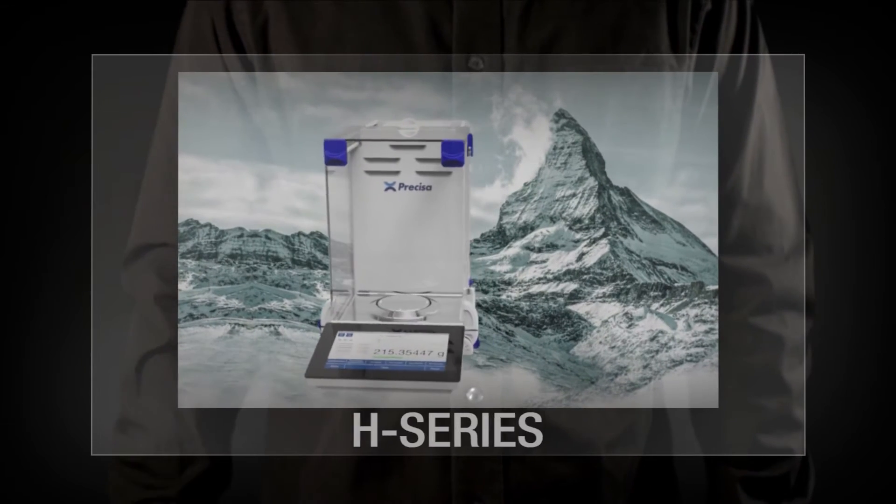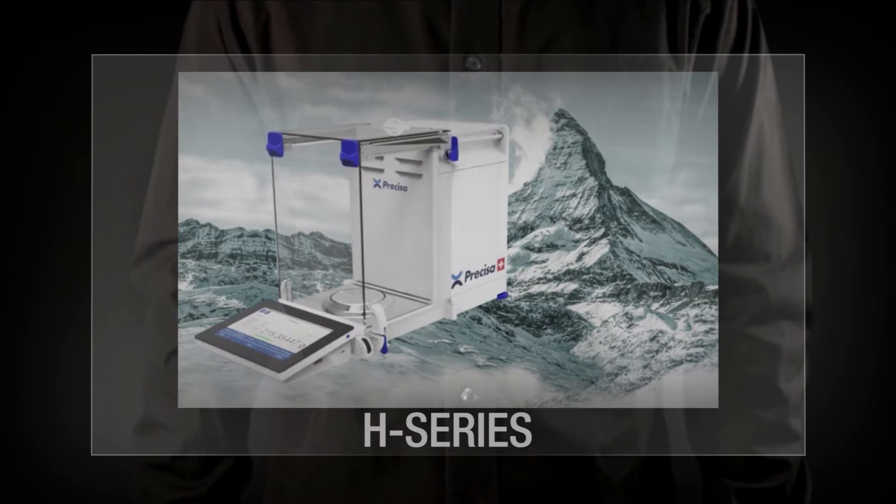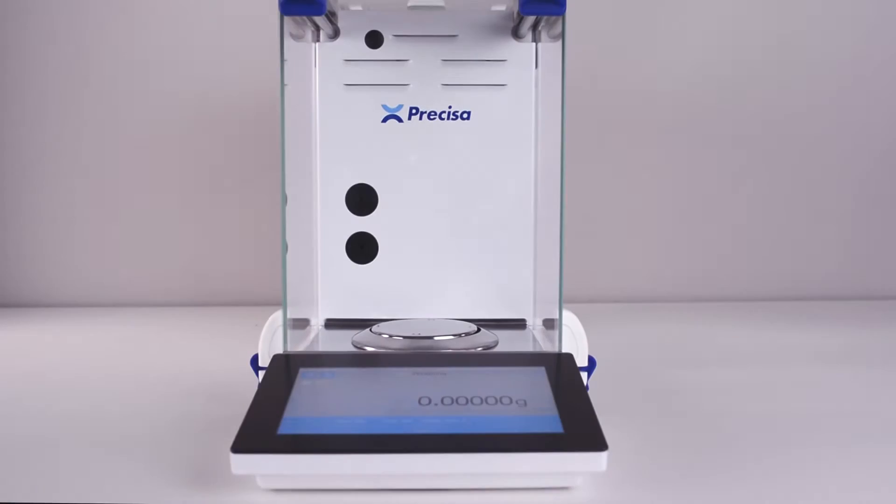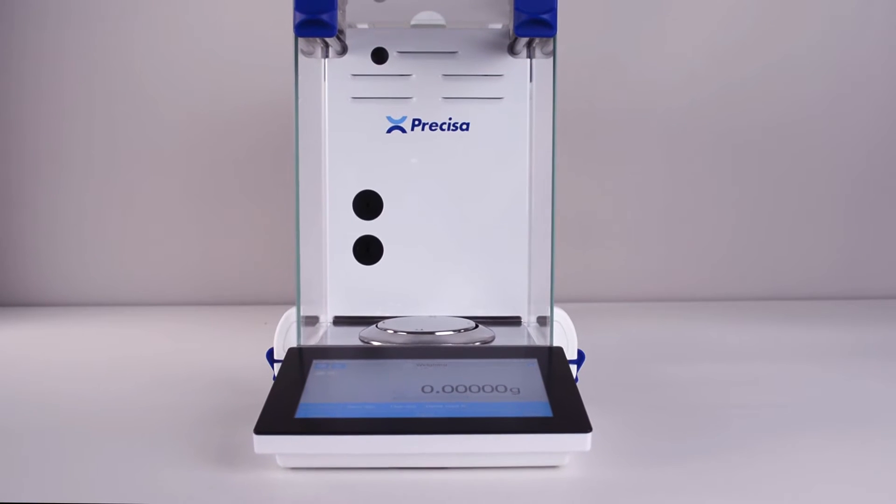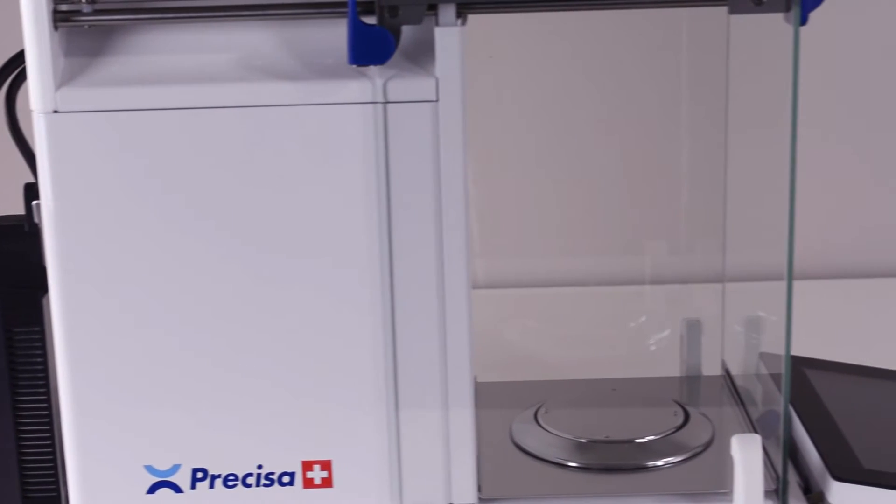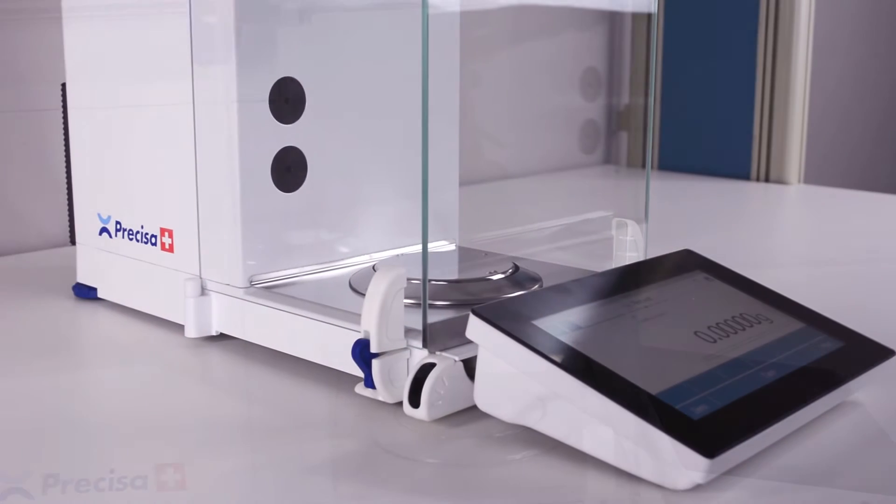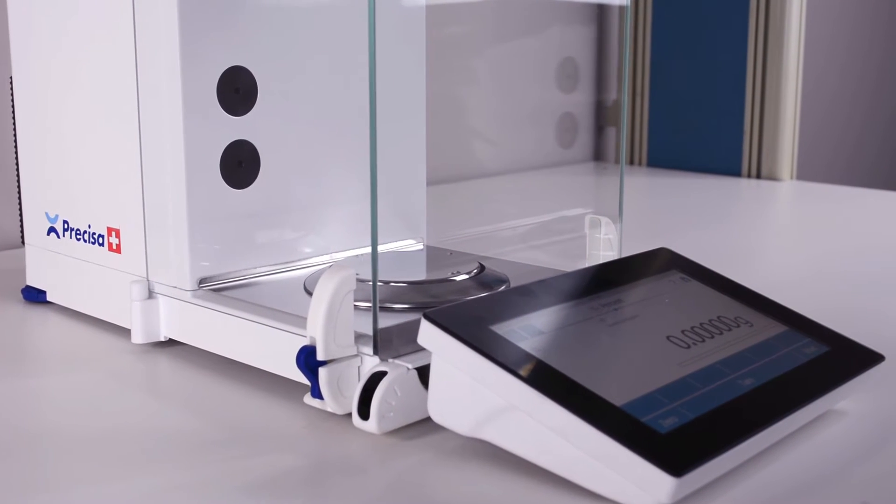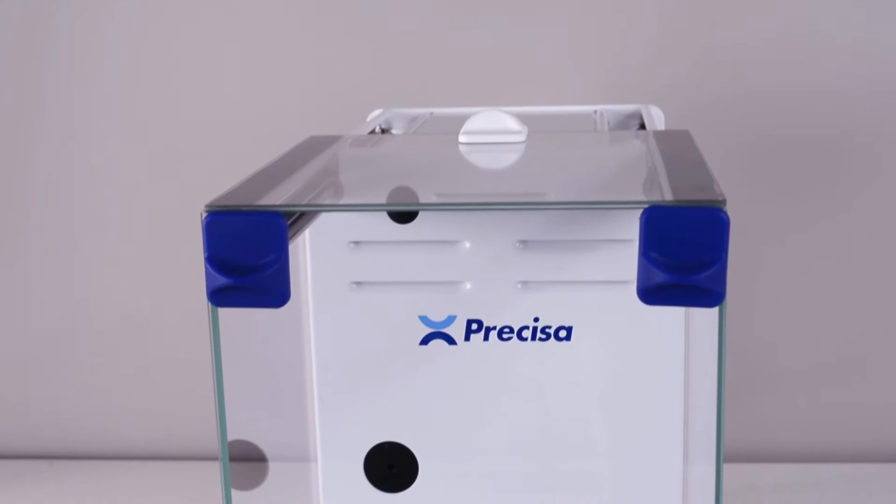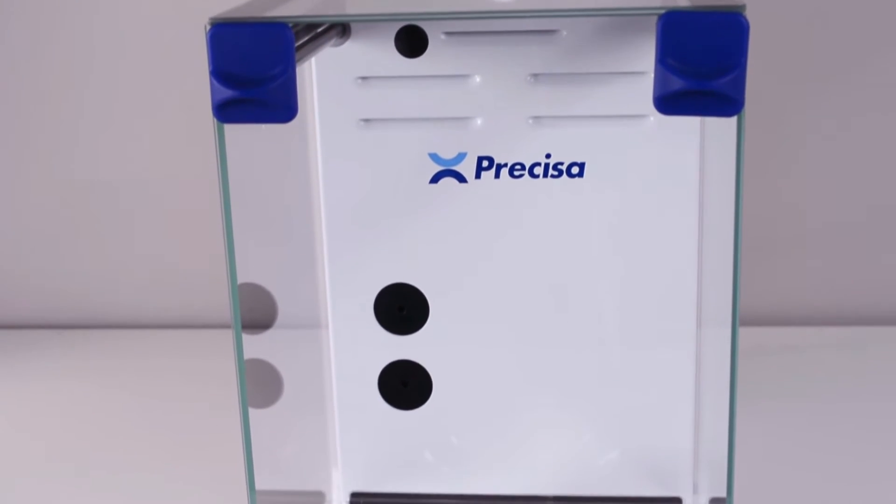The Precisa H series, a semi-micro and analytical balance range with touchscreen software built from the ground up. This balance has been designed to create a tablet interface so intuitive that every single feature of the balance can be accessed without ever reading the manual. After such meticulous work in design and manufacturing, the Precisa H series was born.